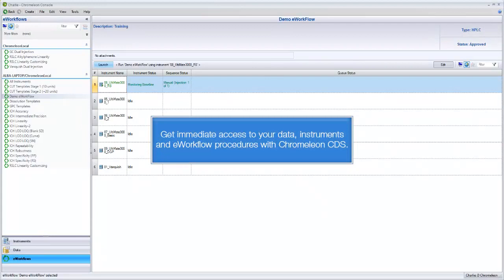Get immediate access to your data, instruments, and e-workflow procedures with Chromelion CDS.